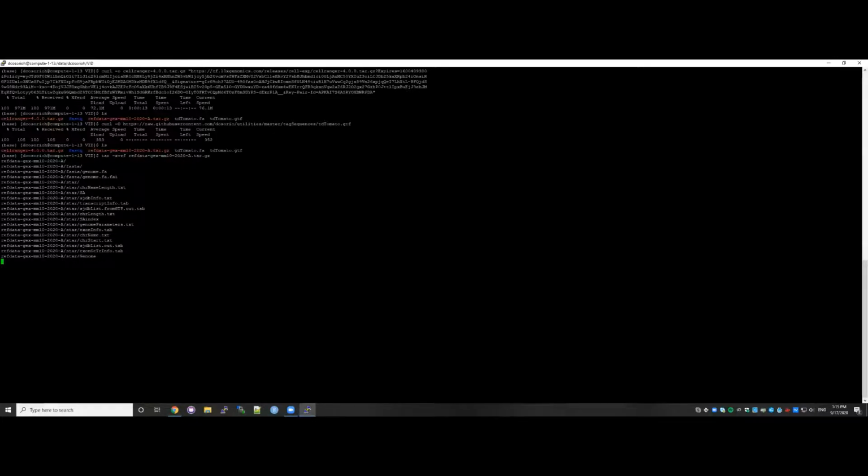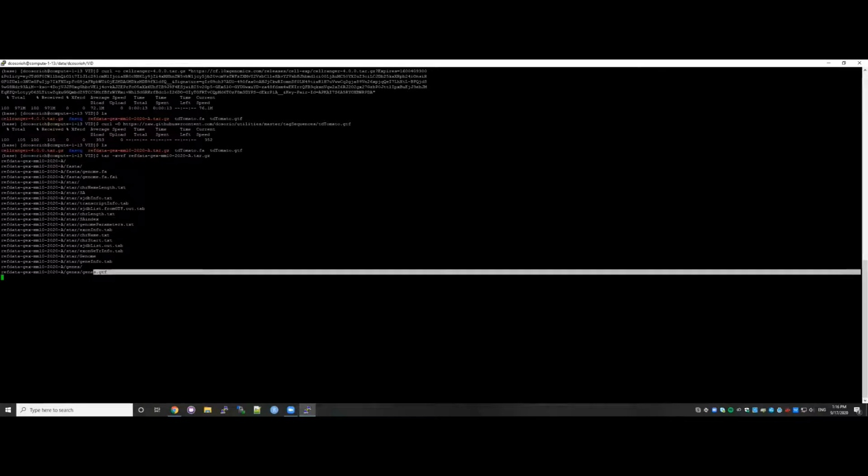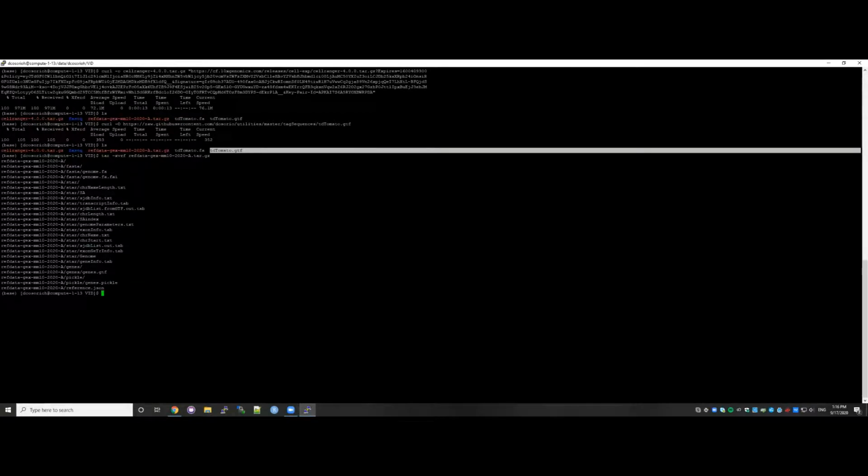I can cut portions, at least in my iPad, I can. So I will delete all these previous steps. Since we say we are going to uncompress the file until it finishes, I will remove that. Okay, so I'm going to concatenate this genes GTF file with this TD tomato GTF, okay?